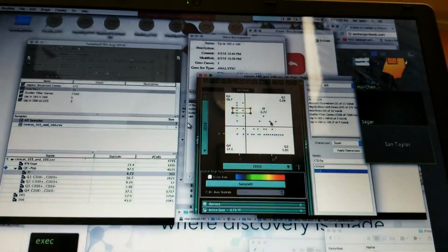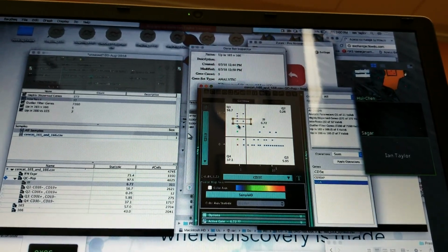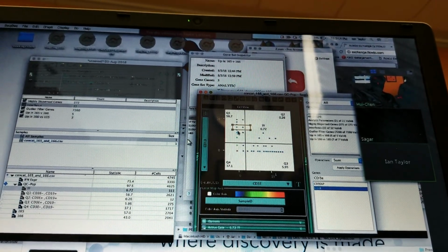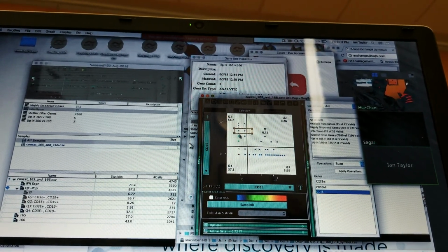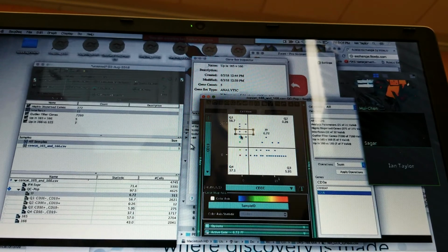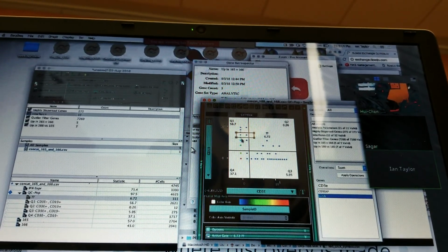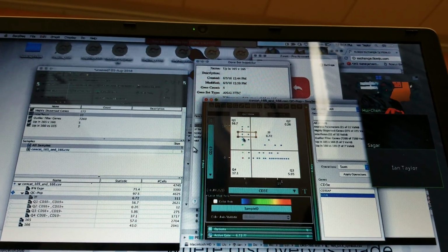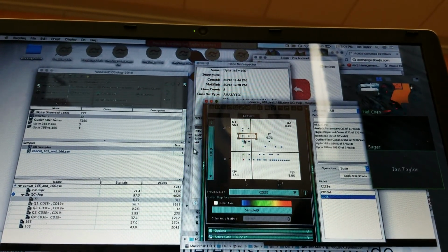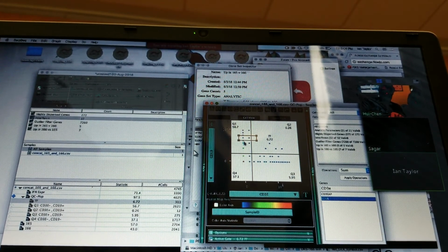Yeah, now Ian, this is very critical because we kind of understand this. This does look like FlowJo. You move the gate around. It's on gene view. No, it's on cell view actually. But you move it around, and then you want to gate on those cells that look that way and make a special group. But let me ask you, how did you make that box? Was it like you hit question mark, or what did you do? You did something to get that little rectangle?